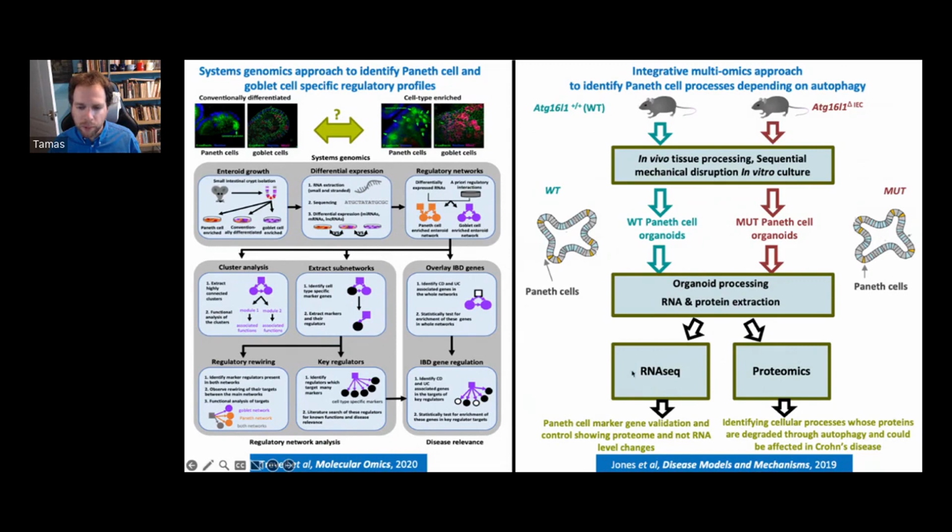But we also had the transcriptomic data, and that was very useful for validation purposes. We learned lots of things from that as well, but mostly we had really strong findings on the proteomics, and we were able to publish this because we had the transcriptomics there as a control to validate that lots of things are happening on the protein level.